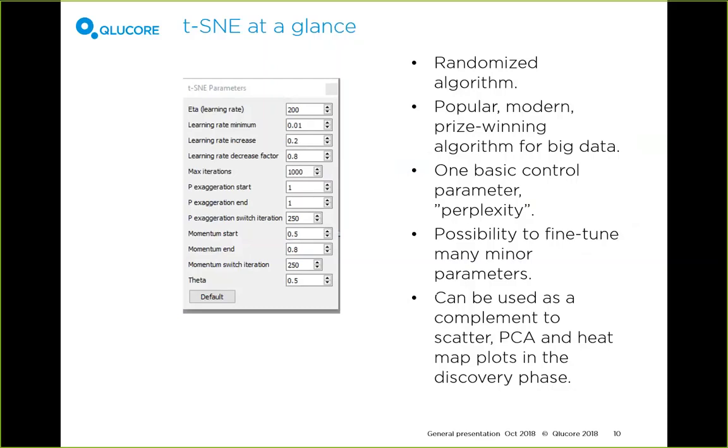The nice thing with t-SNE as a tool is, however, that you can use it as a complement to scatter plotting, PCA plotting, heat map plotting, to do more things and different things in the discovery phase.